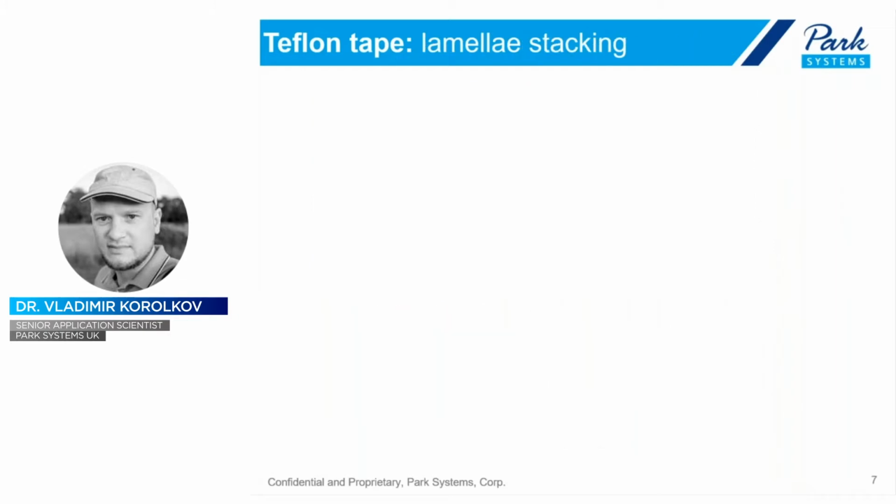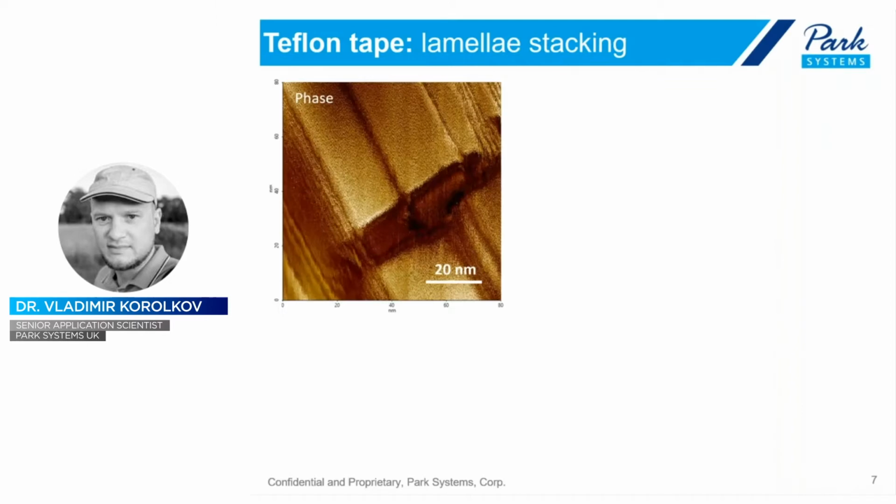And the other question, which is quite interesting in the structure studies of polymers, is how different parts of those lamellas are oriented on top of each other. For instance, if we take another phase image in a different area of the same sample, we can see nice lamellas, and you can almost make out the lines that are running on the lamella structure, and with the cross section taken across one of those lamellas, you can measure again the same periodicity of 5.6 angstroms.